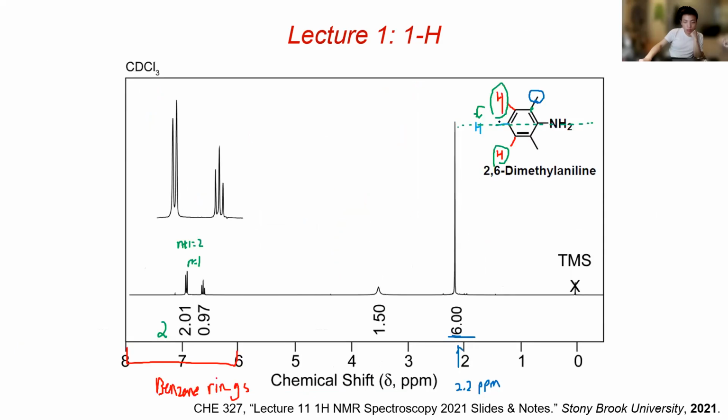So aromatic 3 and 3, that's 6. And plus 1, this is singlet, and it's equal to 0. And there's no neighboring hydrogens because one of the carbon that's next to it doesn't have any hydrogens. So it's empty.